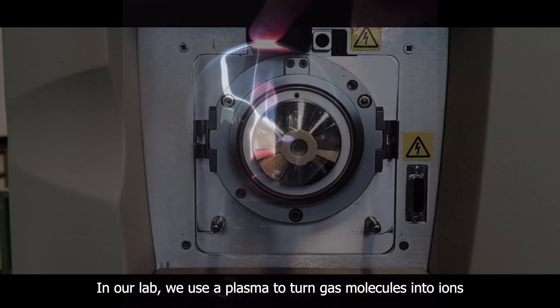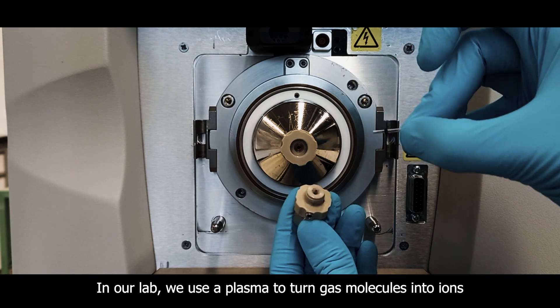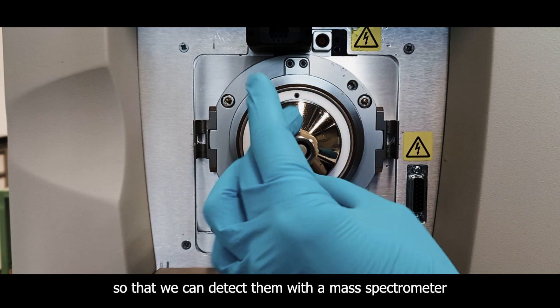In our lab, we use a plasma to turn gas molecules into ions so that we can detect them with a mass spectrometer.